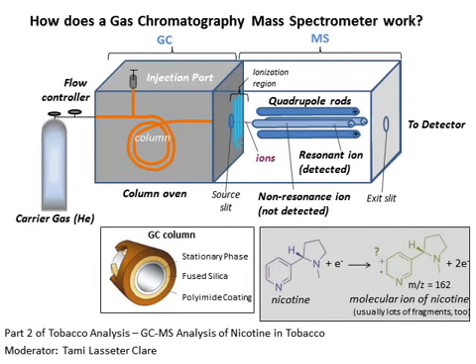GCMS is an abbreviation for gas chromatography mass spectrometry. Everyone is probably somewhat familiar with GCMS from either organic chemistry or from instrumental analysis lecture, but just to make sure that everyone is on the same page, I'll go over the basics of how the technique works.